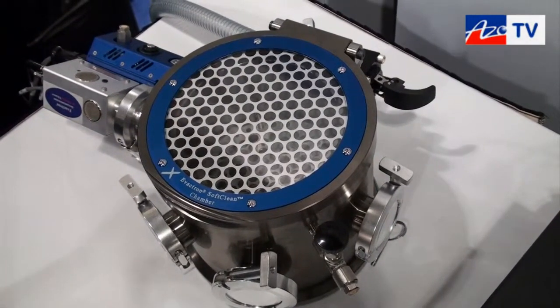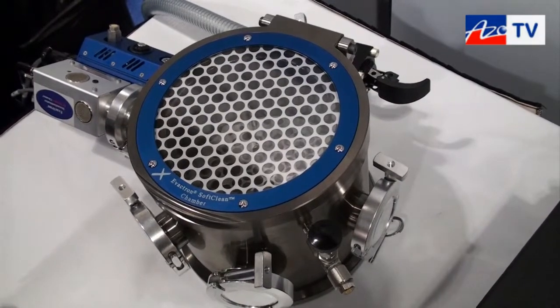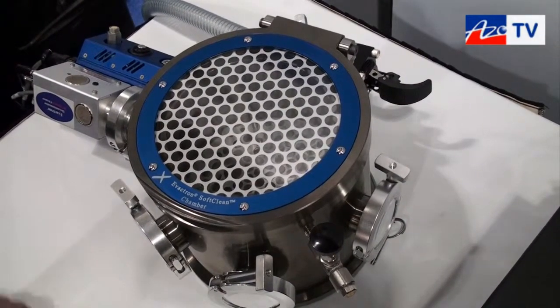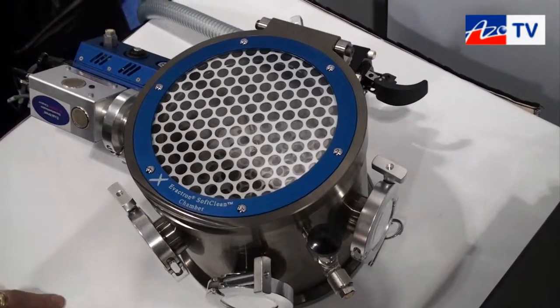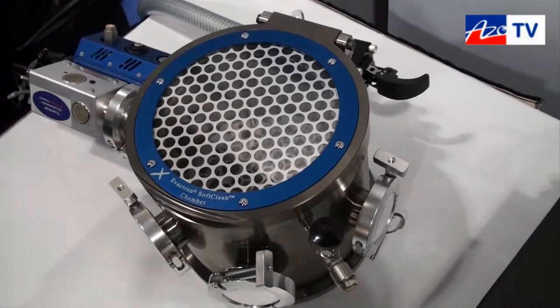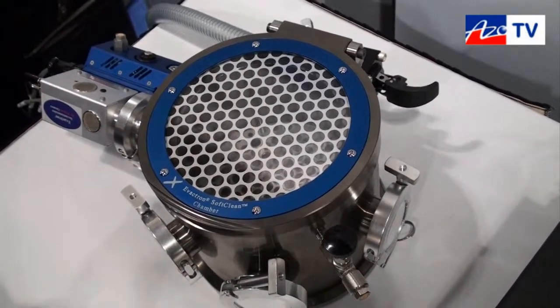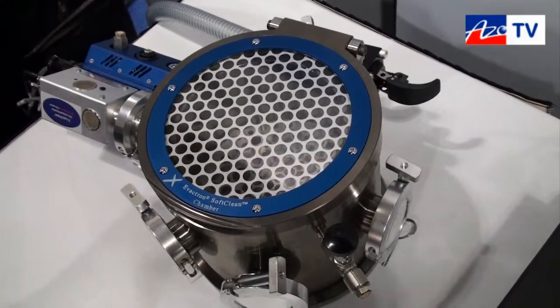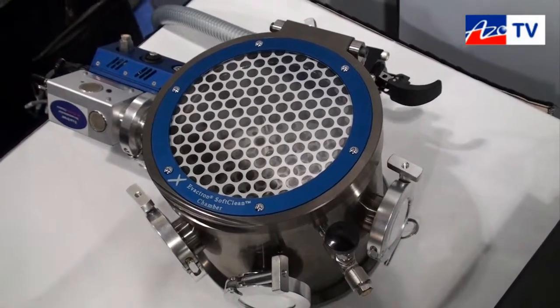If you're seeing carbon on samples and the carbon is actually from the environment and not from the sample itself, it will give spurious results. There's a lot of data in the literature that shows that these plasma systems will purify and clean the environment of the microscope or the chamber, and that the end result is better pictures, better quality data.